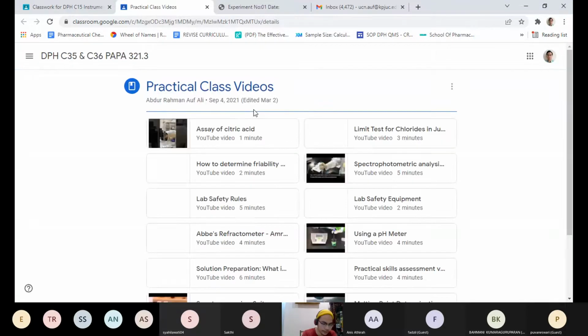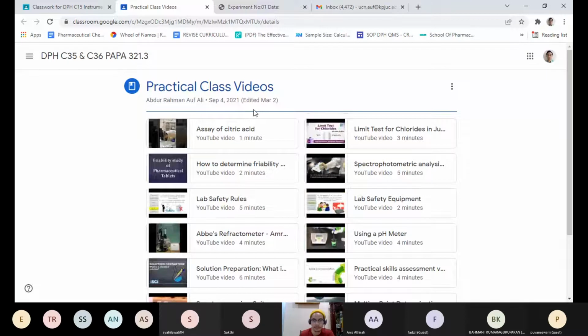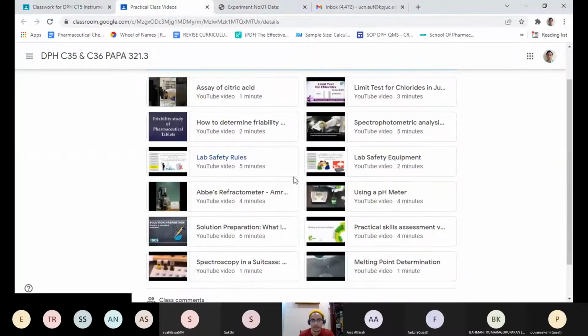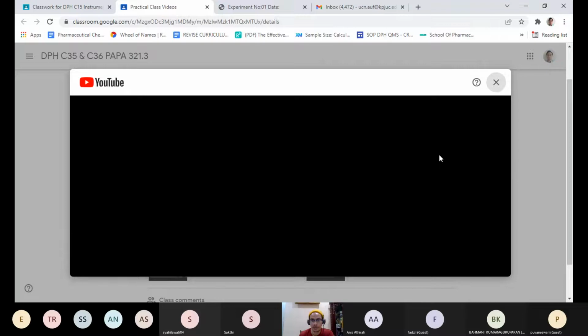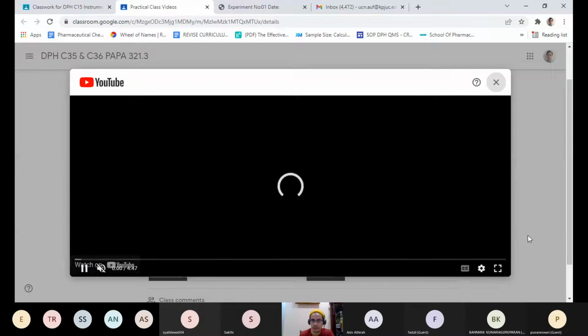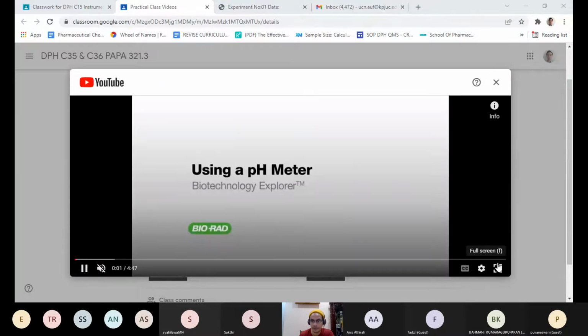So the pH test adalah makmal kalau kita boleh masuk lab, kita selalunya saya akan bagi 3 samples using a pH meter. So I'll be sharing a video which you can access yourself dalam Google Classroom. For the purpose of this class demonstration, saya nak tunjuk live.